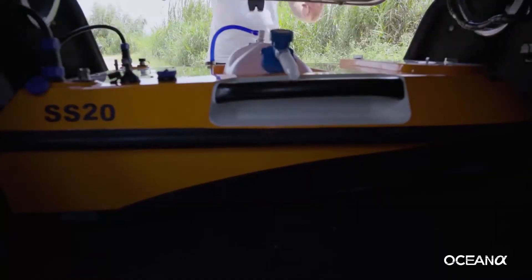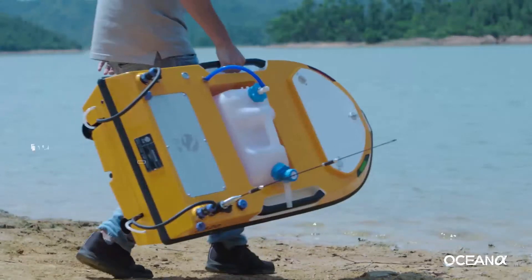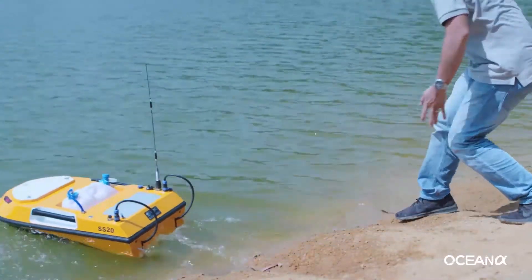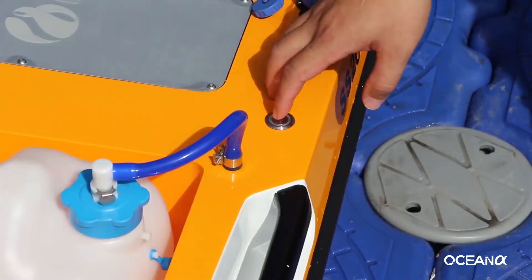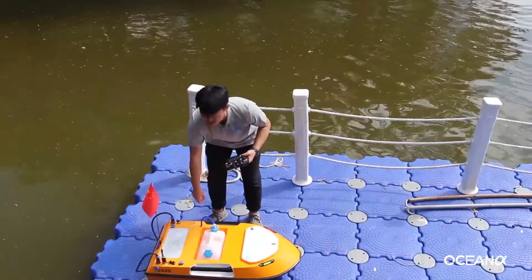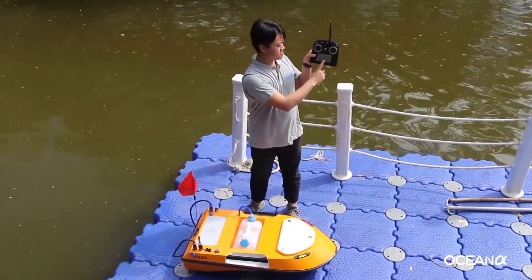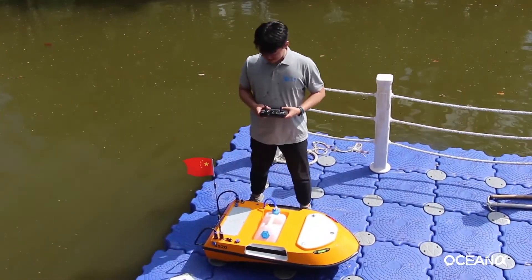After the ground test is finished, test the USV in the water. Two factors should be checked before launching. First, check the battery percentage — turn on the USV and make sure you have more than 70% battery. Second, check if the launching ground is solid.